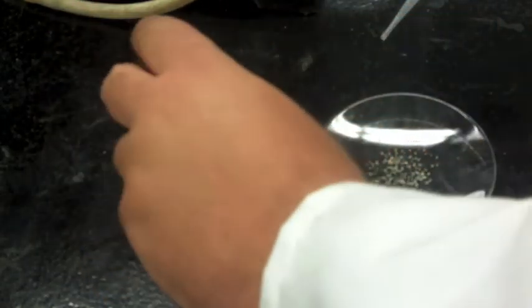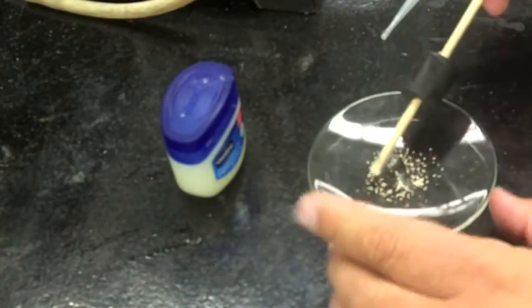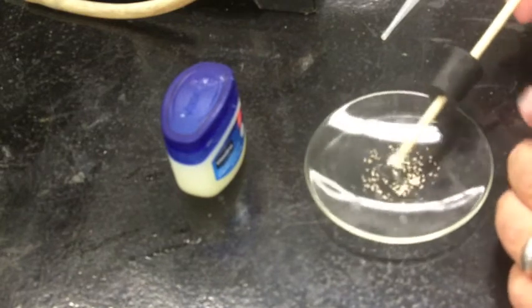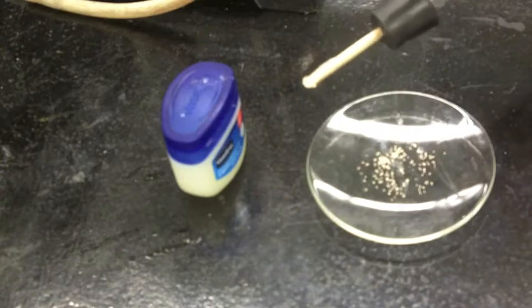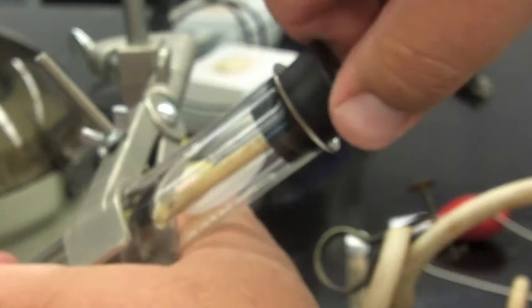Then you just don't need a lot of yeast, just a little bit. It will be in a watch glass, so just pick it up. The key thing is it can't be loose. You've got to make sure there's no loose yeast, because that will ruin your experiment if it falls off too early. Finally, you can reattach the hose and stick that into your tube, being careful not to lose any yeast. You don't want the yeast to be in there quite yet.